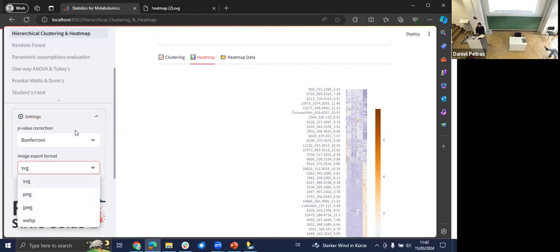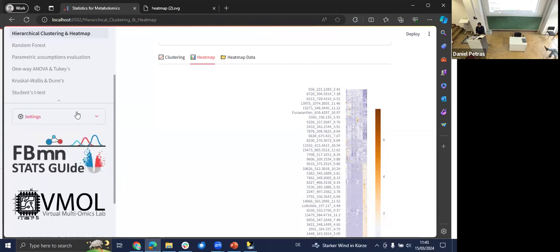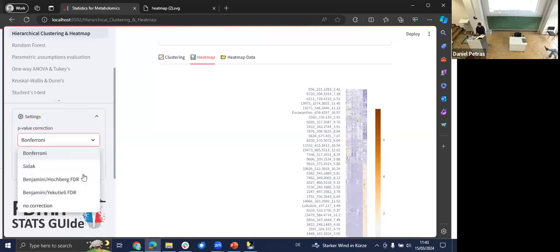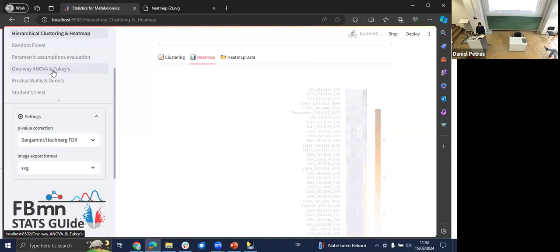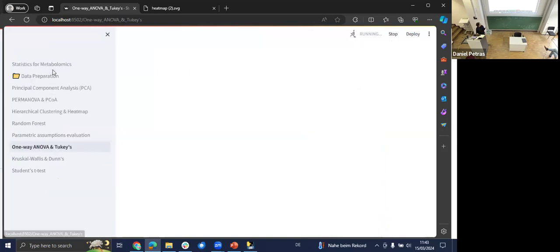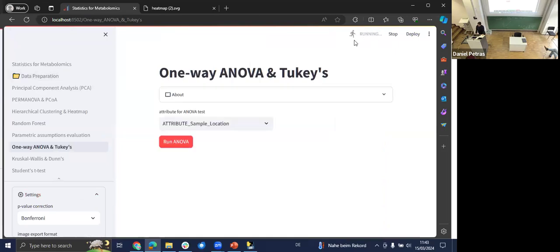And also we have the p-value correction, different types of corrections like Bonferroni, FDR, and Benjamini-Hochberg false discovery rate correction methods, when you are doing your univariate statistics. And here I'm going to use FDR statistics, and we can just go and perform the ANOVA test now. It takes a while, I guess, so that once we do the ANOVA, you can take the results with the significant features. And you can see that it's struggling. Run.